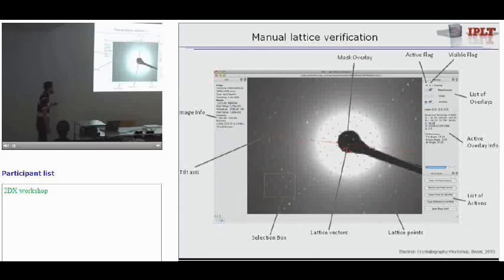Also, if you have a side entry stage, you end up having the tilt axis always in the same direction. For a top entry stage it's a little bit more complicated, and it depends a little on the design whether the cartridge can be rotated or not. So it might be that just for one session you have it at the same position.